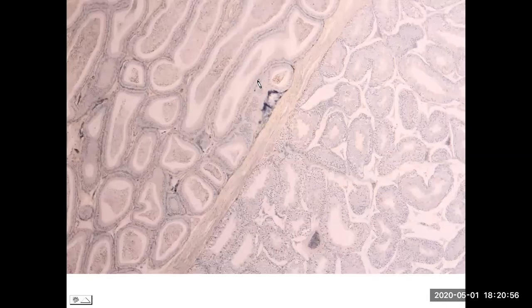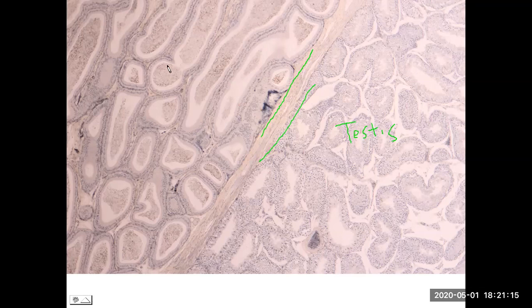So now a separate organ that's on this side here, we're in the area of the testis. And again, we see those familiar open rings, the seminiferous tubules, the enclosed clusters of interstitial cells. Once we cross the collagenous sheath, and it's now onto this view, on this side of the image is where we have the epididymis. So this portion here. So organ right along the testis, but outside of that collagenous sheath.